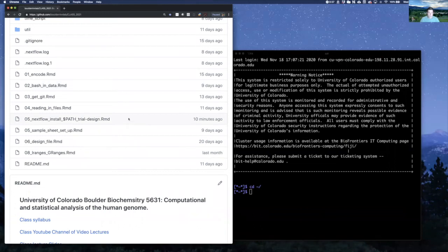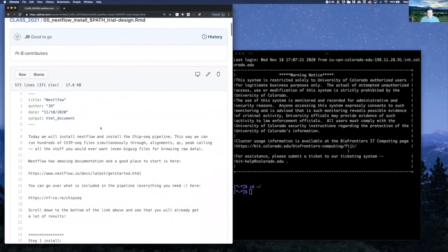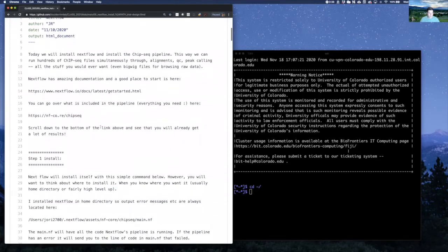Hello, everybody, and welcome to today's class where we're going to talk about Nextflow, installing Nextflow, and what the design file Nextflow requires. The previous video went over what Nextflow is and how we're going to use it, and we'll touch on that a little bit as we go through the document. But today we are on 05, Nextflow install path and trial design. So if you click on there, you'll see all the stuff we need for today.